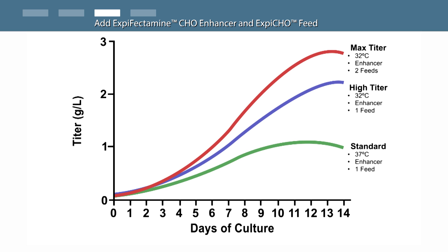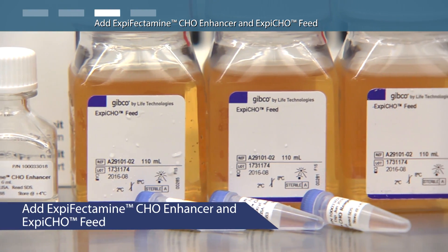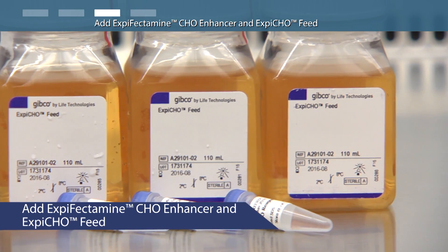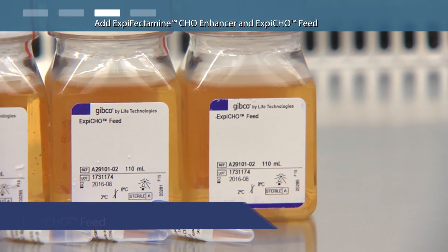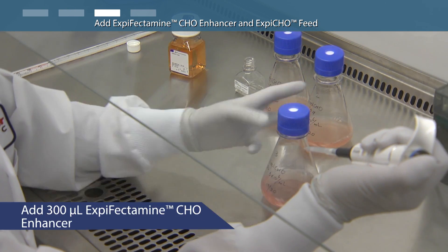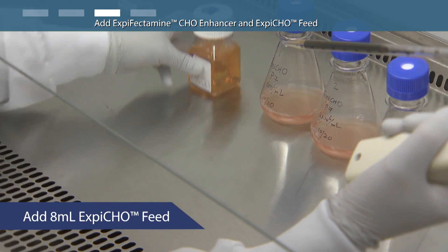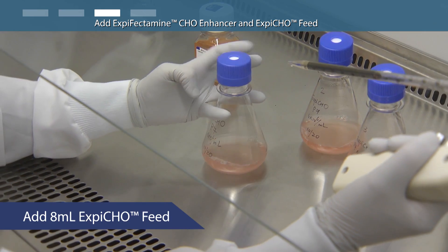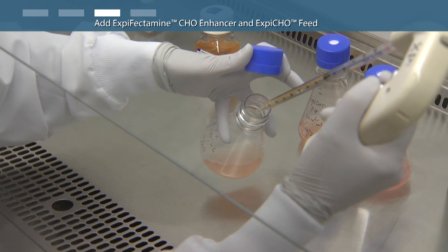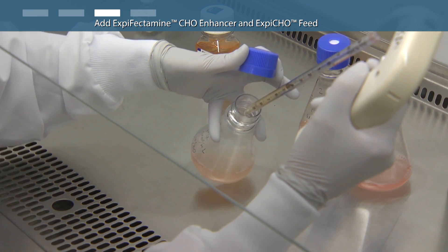In this video, we will follow the max titer protocol. It is not necessary to pre-warm the XBFectamine enhancer or the XBCHO feed prior to addition to flasks. On the day after transfection, add 300 microliters of XBFectamine enhancer and 8 milliliters of XBCHO feed to each of the 250 milliliter flasks, gently swirling each flask during addition.